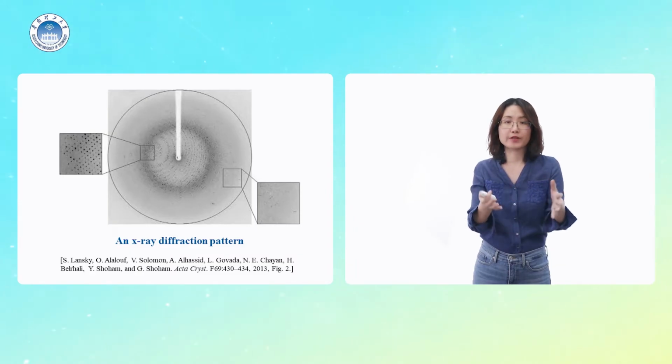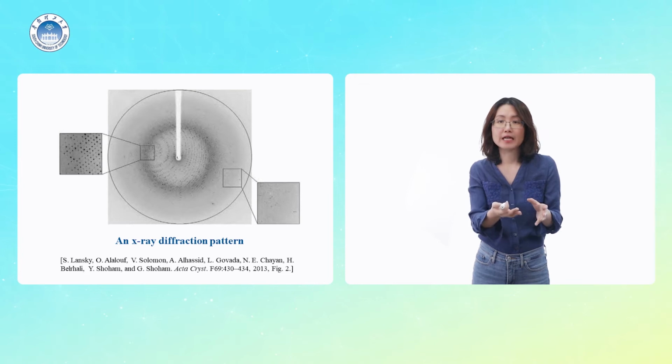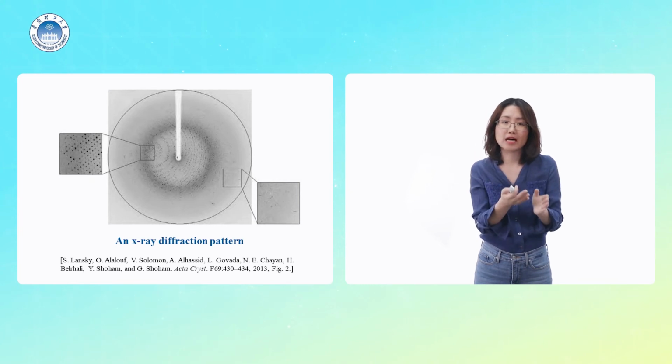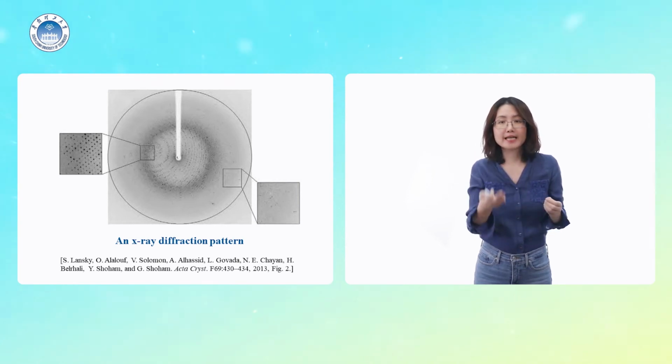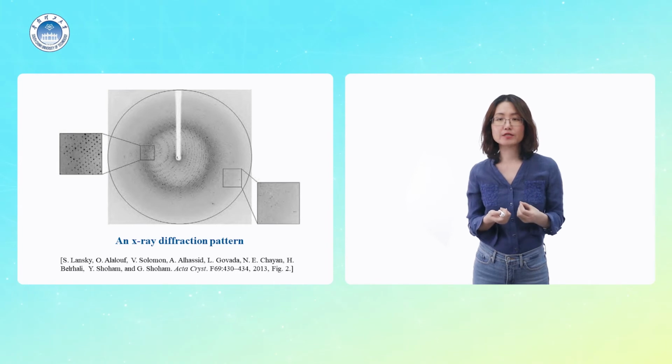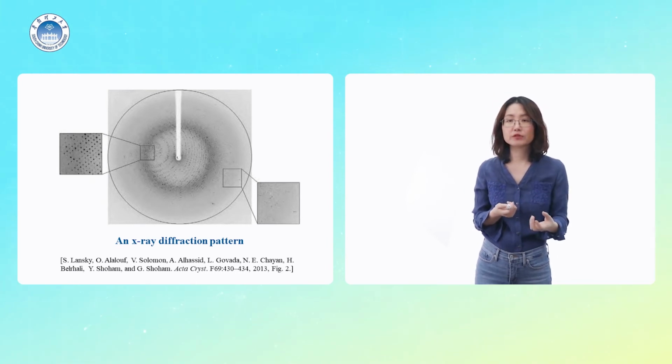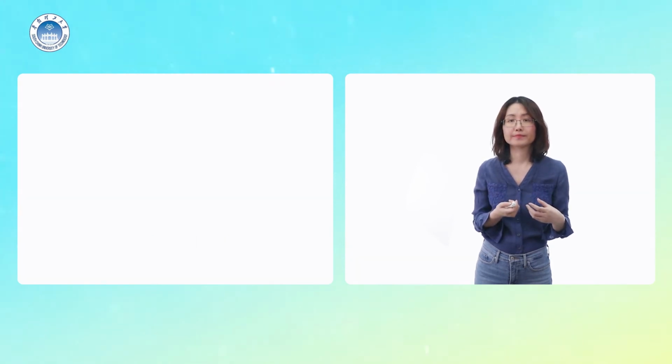So, as shown in the figures, the X-ray photograph is a two-dimensional section through a three-dimensional array of 72,000 reflections. The intensity and the positions of these reflections are the basic experimental data of an X-ray crystallography analysis.